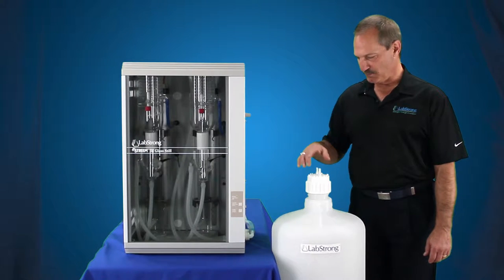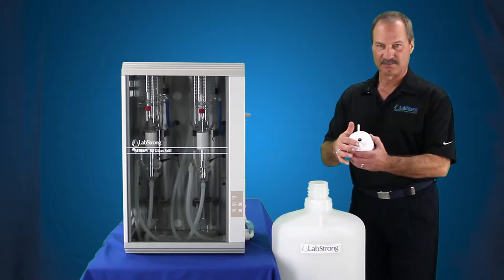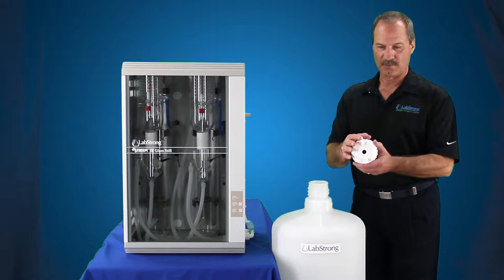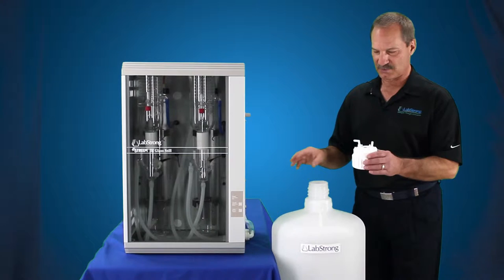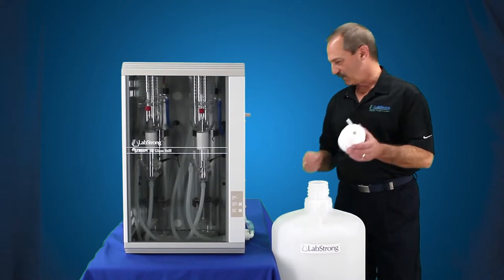First thing you want to do is remove the cap — pull that cap off. There's an inlet for your distillate and this is your overflow drain, just in case any float switch doesn't work and it actually keeps pushing water into the tank. This will actually go to an atmospheric drain.